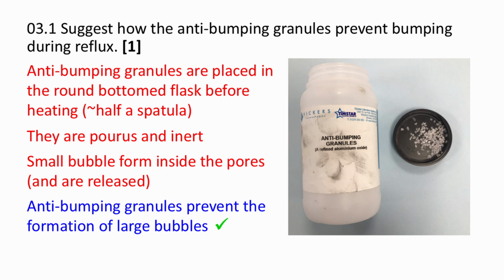The photograph on the right shows a 200 ml container of anti-bumping granules with some of the anti-bumping granules poured into the lid. To address the question, anti-bumping granules prevent the formation of large bubbles.